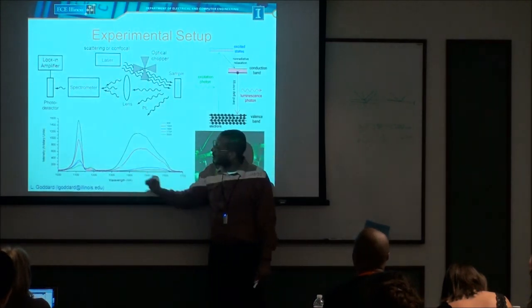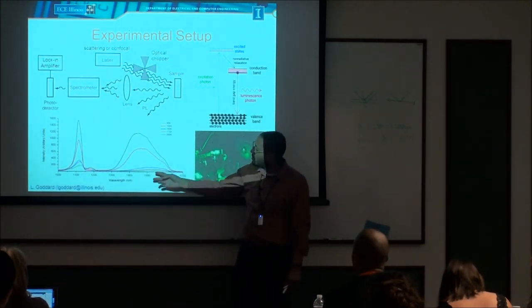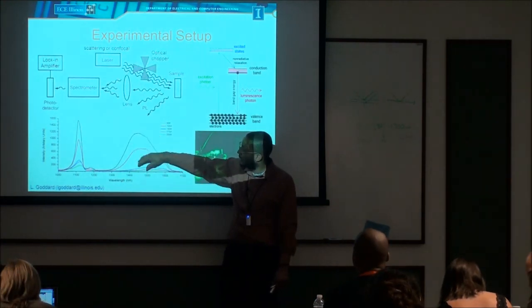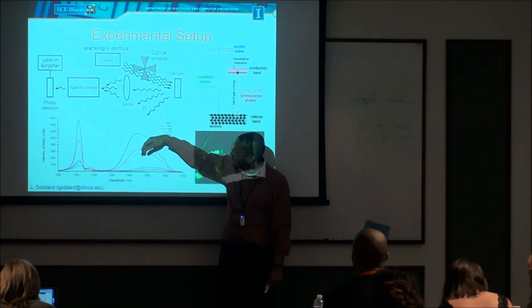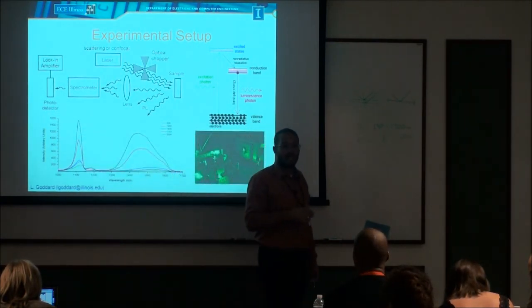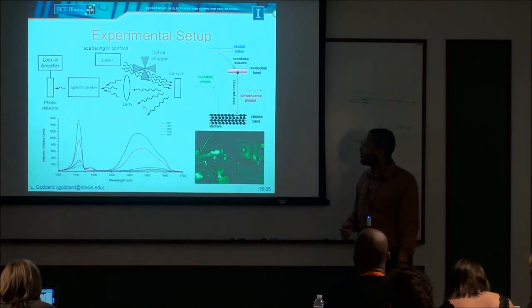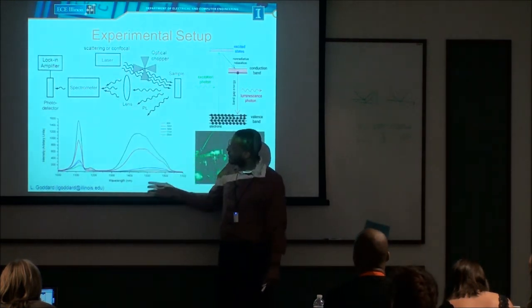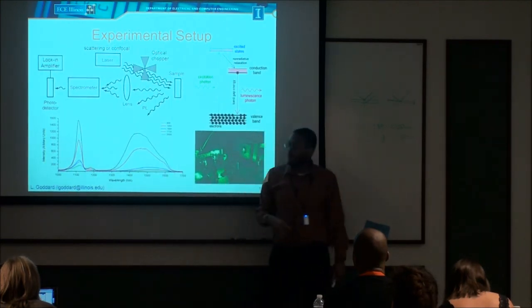These are our typical photoluminescence plots. On this particular sample, there's an active region for a laser that emits around 1450 nanometers. There are some other layers in the material that emit at 1100 nanometers. So from the information about the amplitude and also the width, you can tell things about the quality of the material that you have.